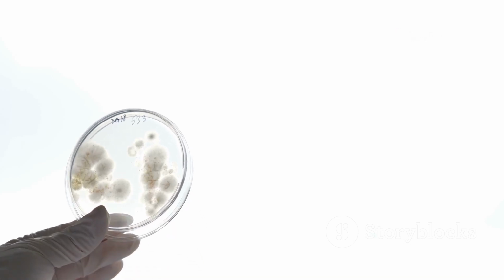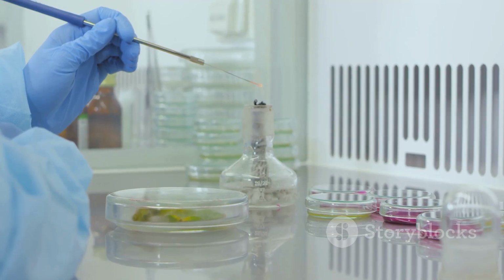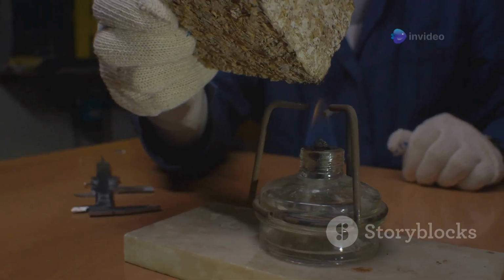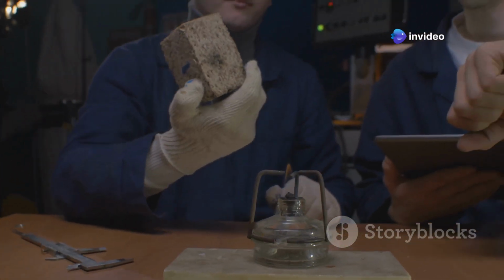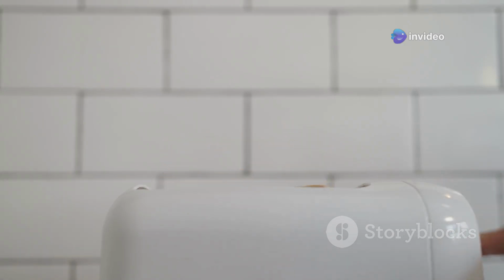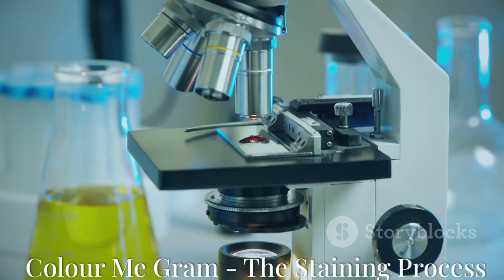Once our smear is ready, we need to fix it. This is a fancy way of saying, let's make sure the bacteria stay put. We do this by gently heating the slide, which kills the bacteria and makes them stick to the glass. Think of it as lightly toasting our bread to keep everything in place. Now our bacteria are ready for their colorful makeover.